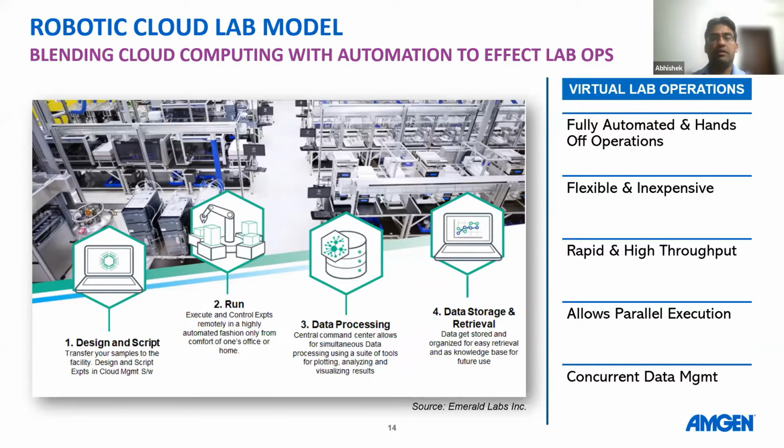So this has been great because when COVID happened, labs got closed and companies were wondering how we can run our operations. But having these kinds of options can really make things work. They can also make things work by allowing the scientists to monitor things from home and make sure that everything is going on well. It is not to infringe on one's work-life balance, but just to make sure that within 8 to 5 or whatever the times the person is working, it can be done efficiently and it can be operated really quickly.